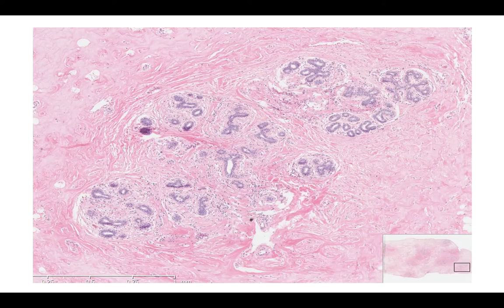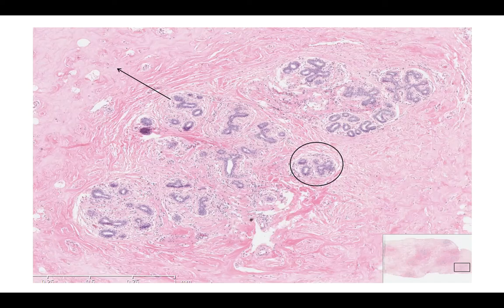Here is a low-power view of the breast on slide 168. The histology of the breast can be loosely divided into the ductal system, including the terminal ductal lobular units, or TDLU, and the surrounding stroma. Additionally, there is a nipple aureolar complex, which will not be focused on here, but can be seen in slide 170.